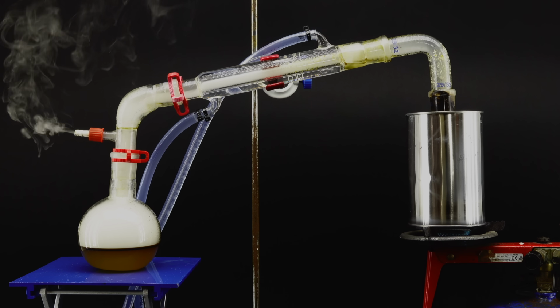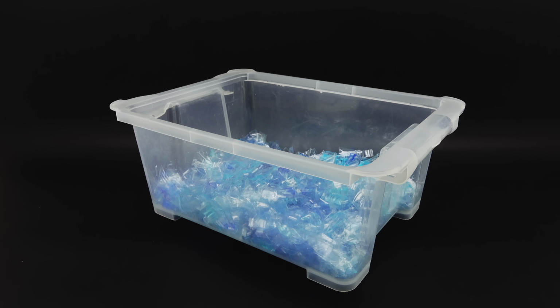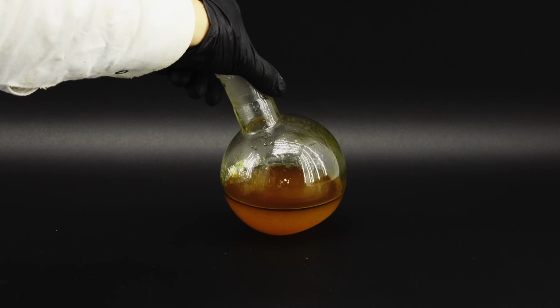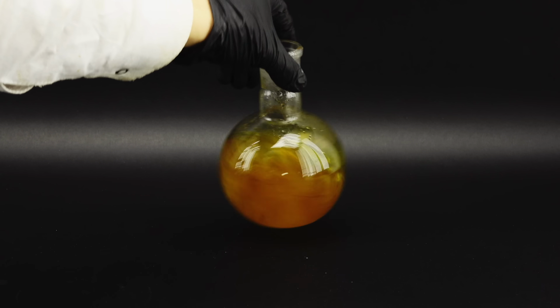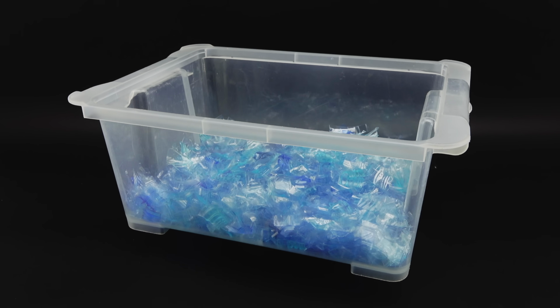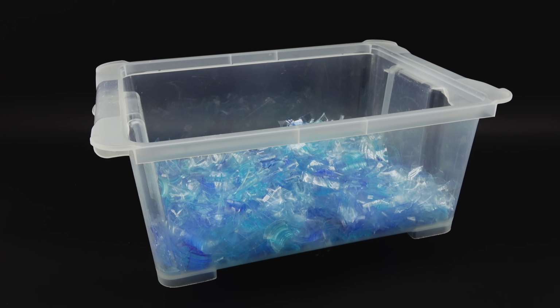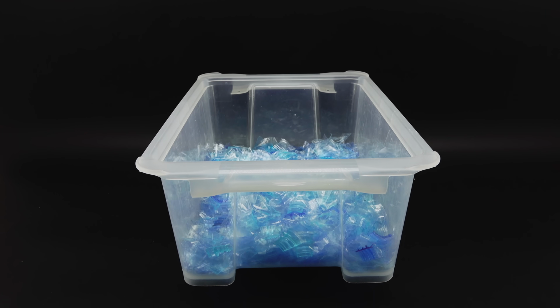That's why a while ago, not really knowing what I am getting into, I set off on a journey to turn plastic waste into one of the coolest molecules, and since not many people seem to have attempted this before, I wanted to see if it could make some decent benzene. Anyway, before figuring out how I am going to forcefully tear through some plastic to steal its benzene, I first have to get some of it.